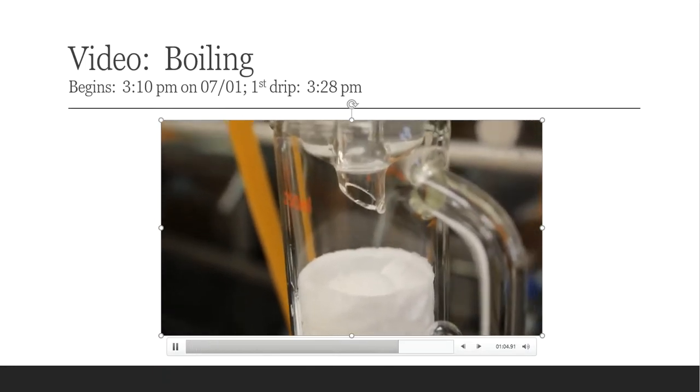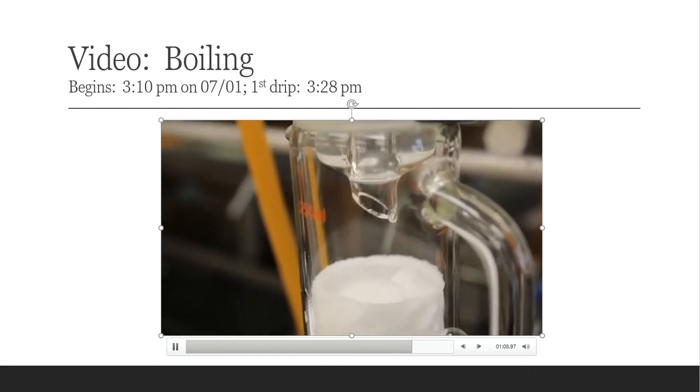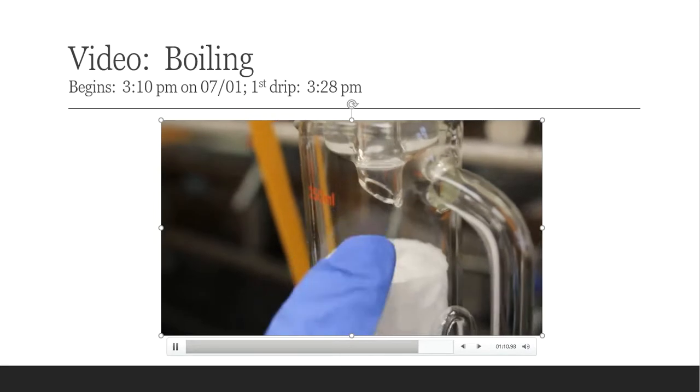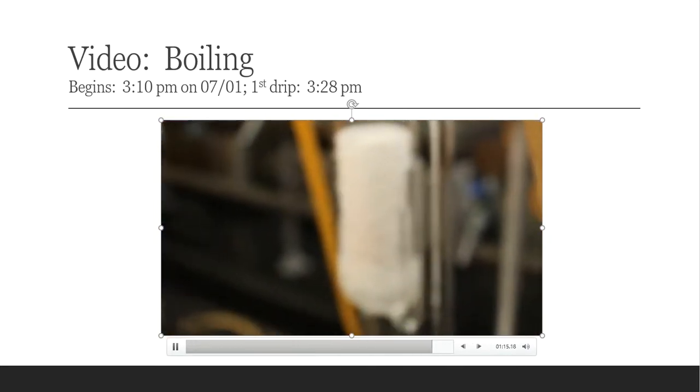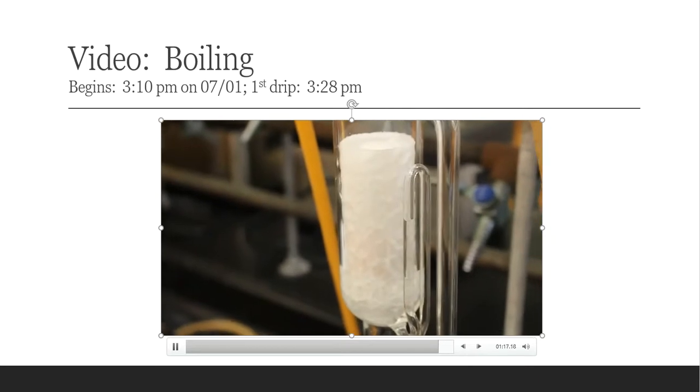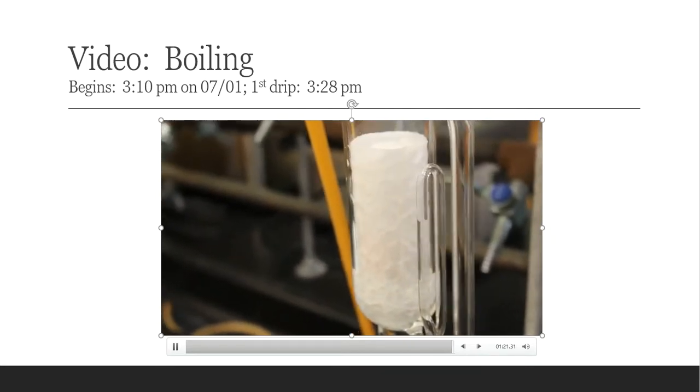Okay, so I'm just going to continue to wait, and I'm going to write down the time at which I see the very first drop into the Soxhlet chamber. And again, this is where my peanuts are going to be located, and my peanuts need a bath, and that bath is going to be my petroleum ether that I'm using from down below.